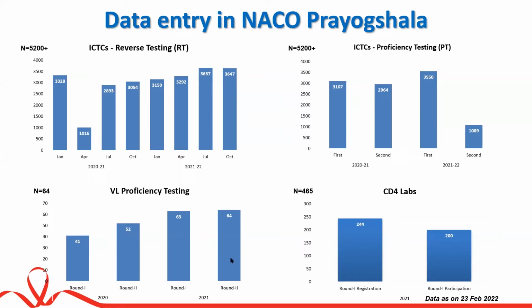So I just gave the second round also, because today onwards, people received the panel 2 days back. They were sent the panel on 28th, and I think I saw a few data already submitted. For the second round, we are expecting all the laboratories, meaning 100%, which is 64. We have 64 public health sector laboratories in India now. All are functional, all supposed to participate.